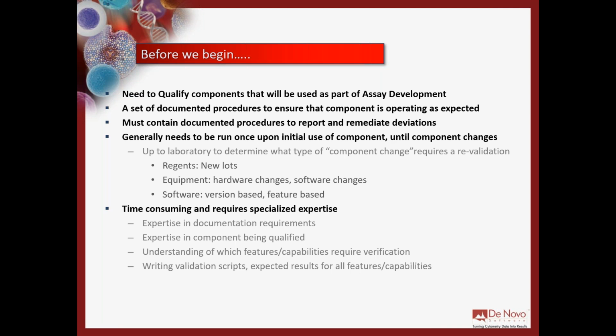You need expertise in the component being qualified. You're not going to go qualify some complicated instrument if you've never used it before. How are you going to write those procedures? So you need somebody who really knows that component or that instrument or that device or that reagent to know what can go wrong, what needs to be tested.